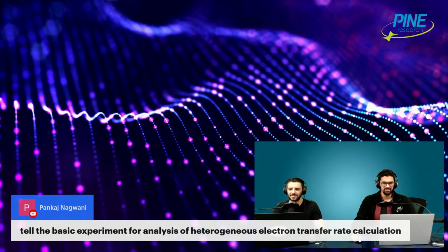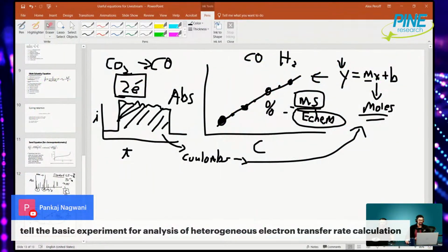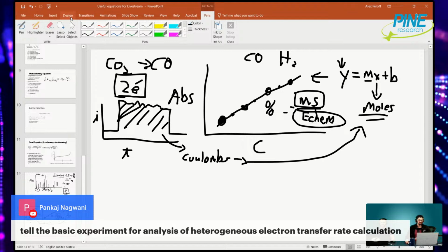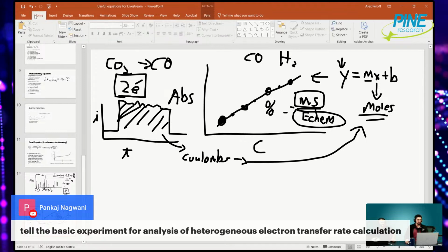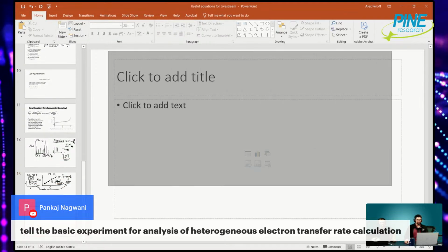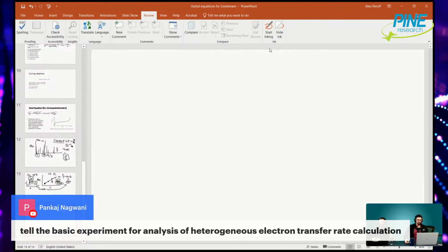I was speaking with Neil about this earlier this week, and we think that there are three methods. You can talk about the trumpet plot. There are three different ways you can calculate it. I still have to do this experiment. When I do, I'll talk about it on a stream, or I'll do a webinar on it or something. So there's generally three ways.